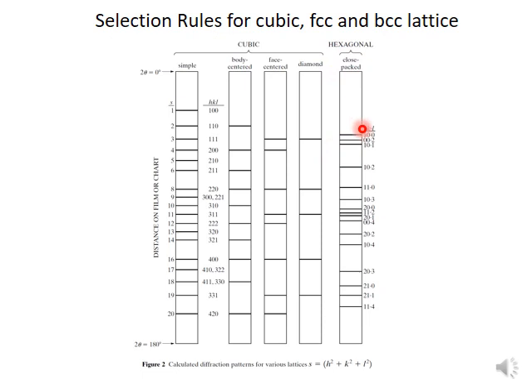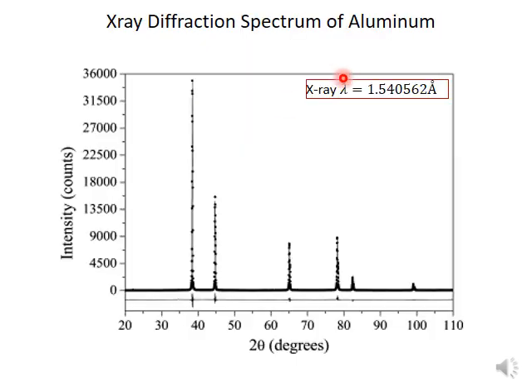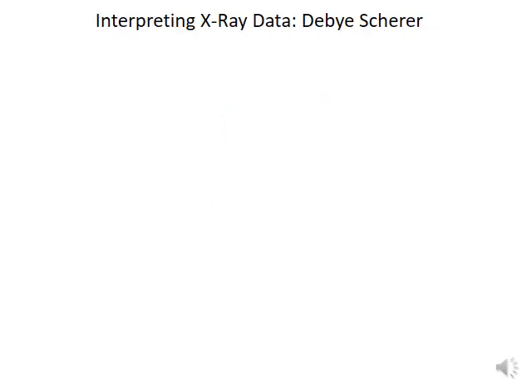As hexagonal is normally separate from a cubic system because the c-axis has a different length in the hexagonal system, that's why they are written separately. Okay, so we would use this information, coming back to the data. We have to interpret this data. Procedure to interpret this data.